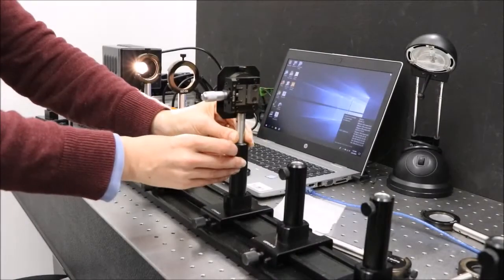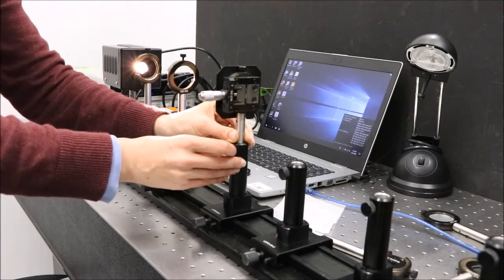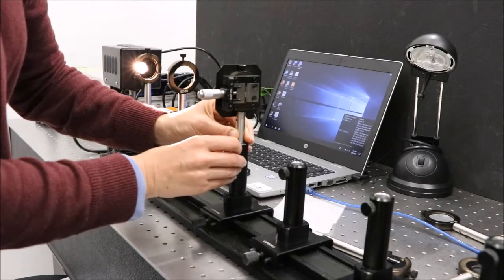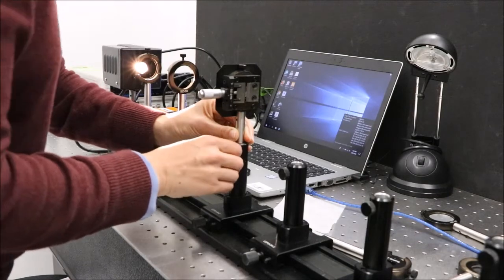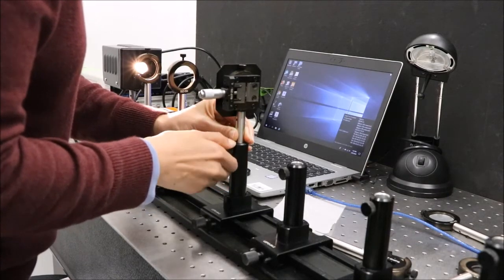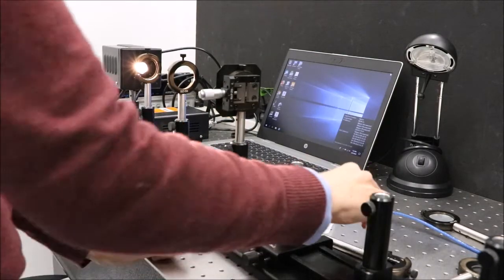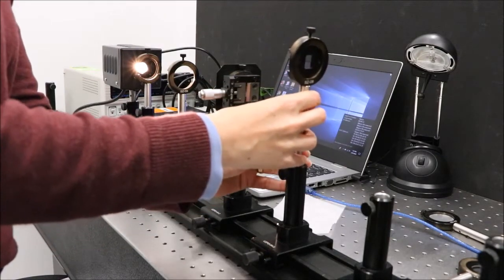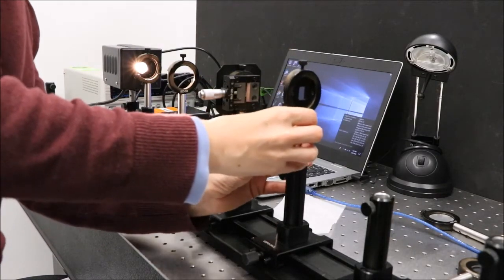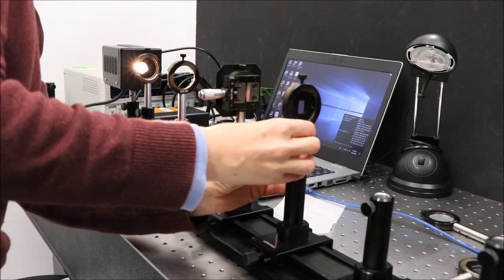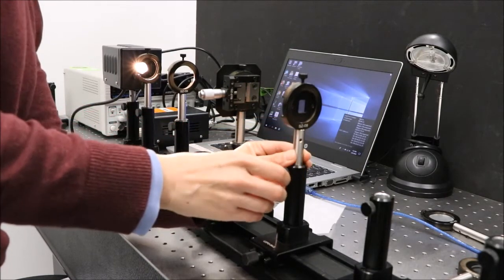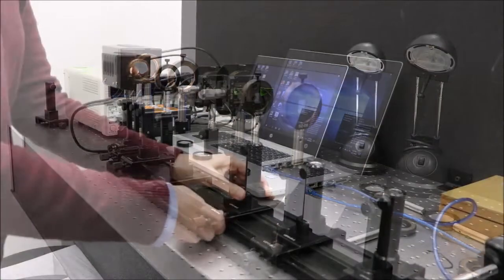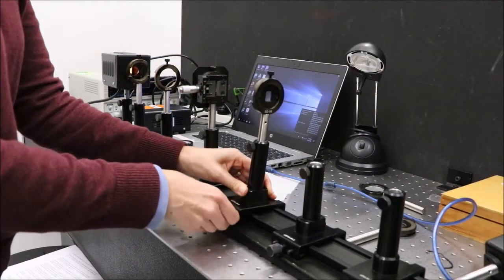I'm going to set the height of the slit and the transmission grating. We'll take these components out, leaving them on their carriers.